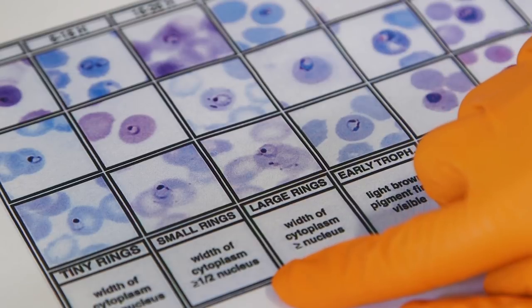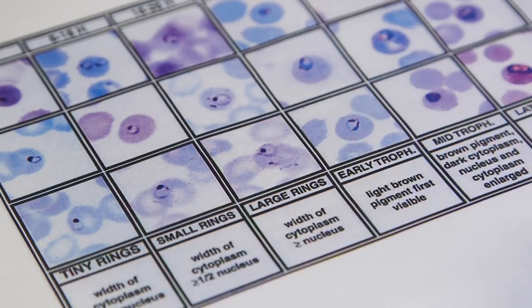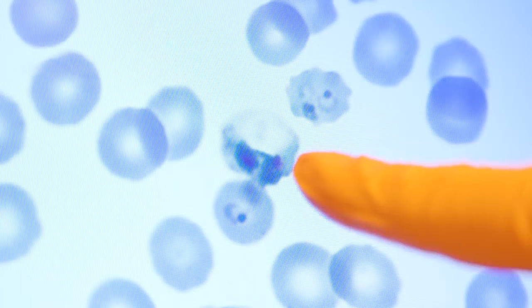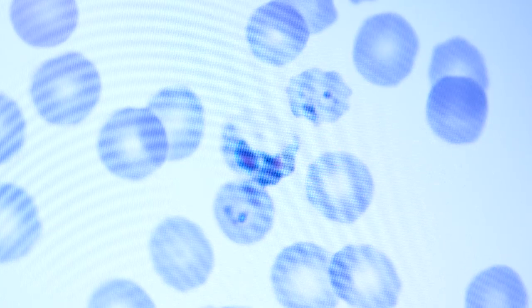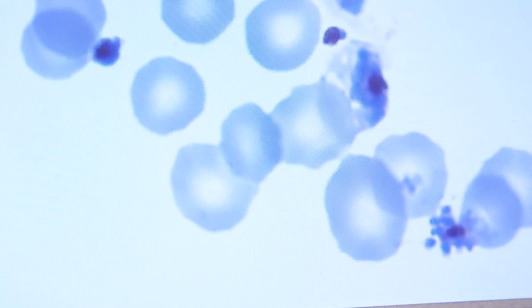The very small ones are rings that will then grow into bigger parasites called trophozoites, and these will start multiplying and forming a schizont.